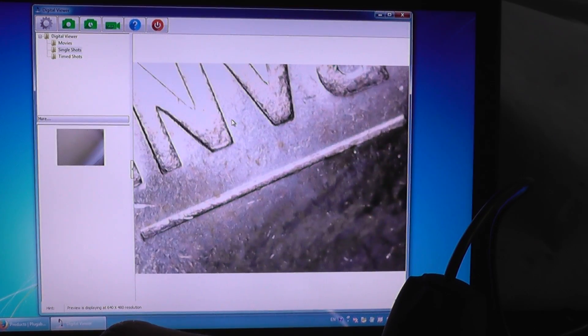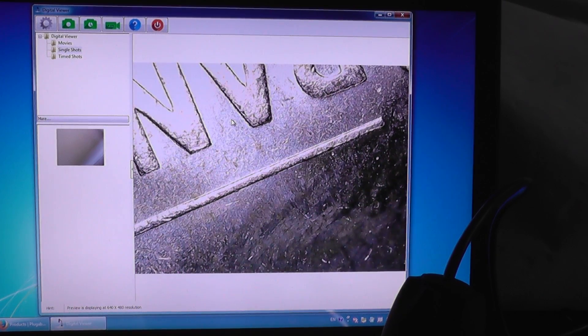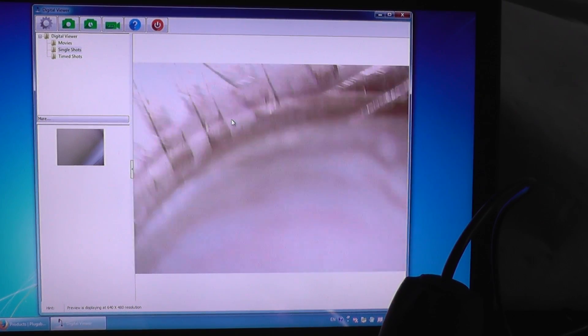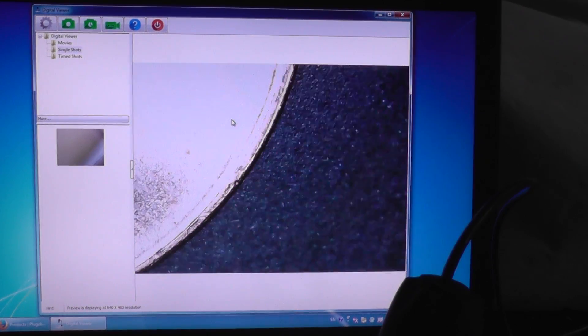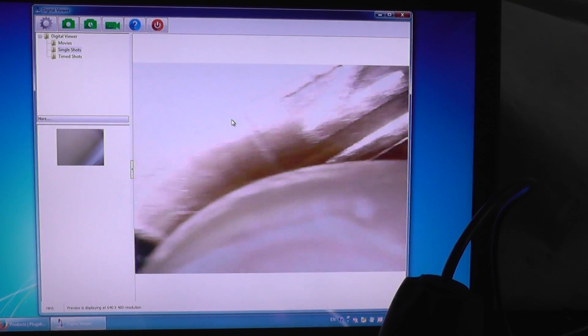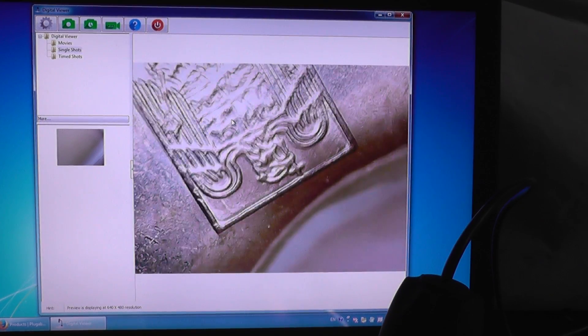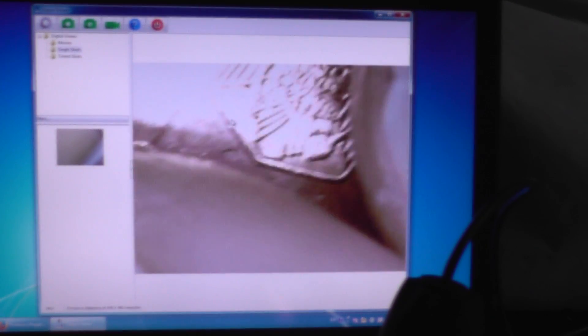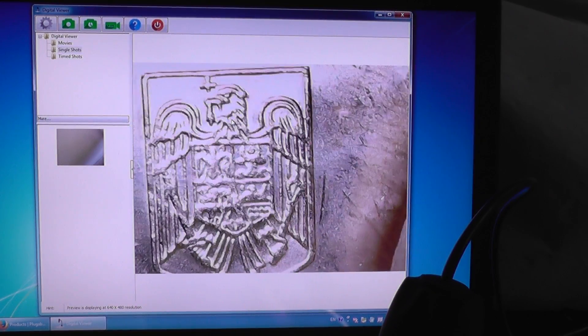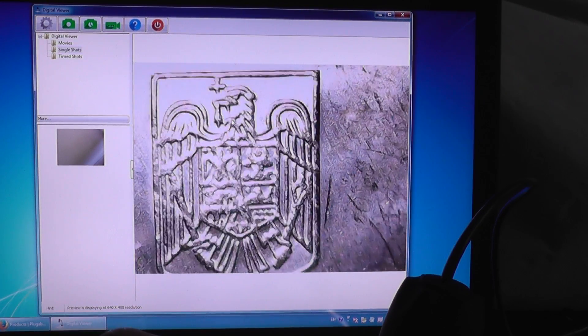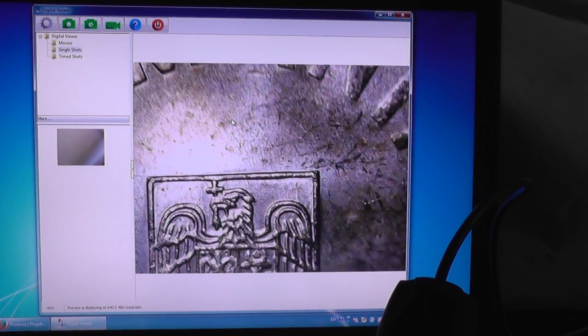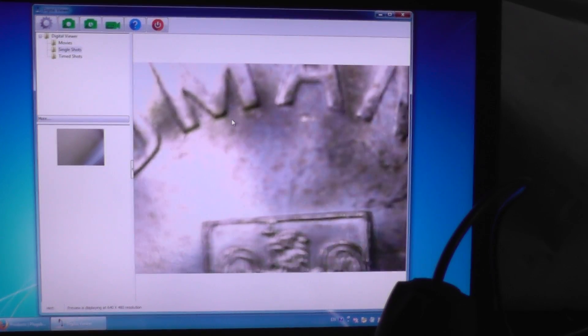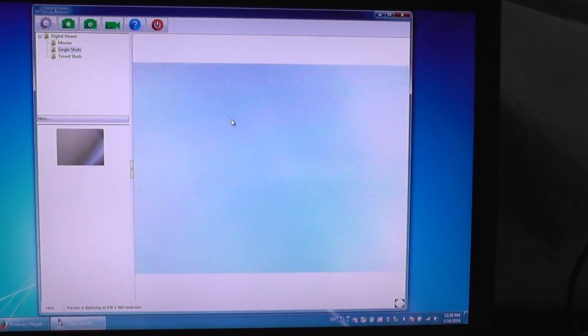And there you go. On the other side. So you can see a lot of details from the material. Let's try something else.